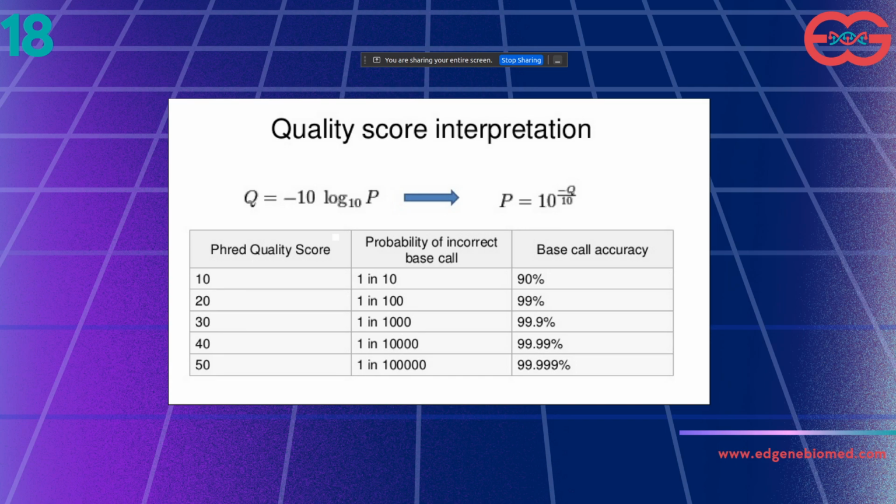Now again the question comes: are we losing our data? Yes, we are losing some data, but what we lose is somewhat covered in the remaining data, because whenever we go for sequencing, we go for millions of reads. So there are chances that the data which we have discarded below 20 might be present in the data which we have retained. So this is very important. Always understand that we use a quality score of at least 20 or more than 20. Not more than 30. We choose a value between 20 and 30.